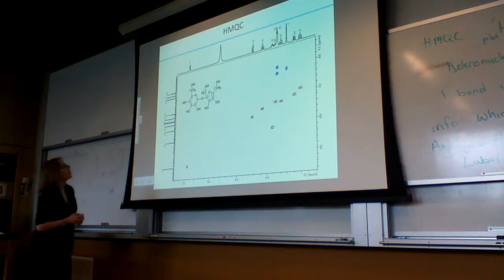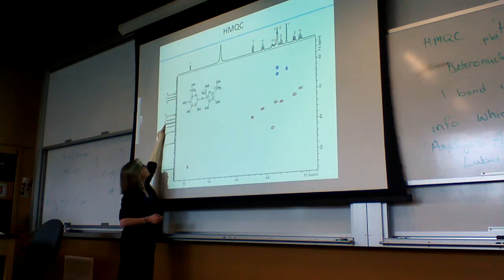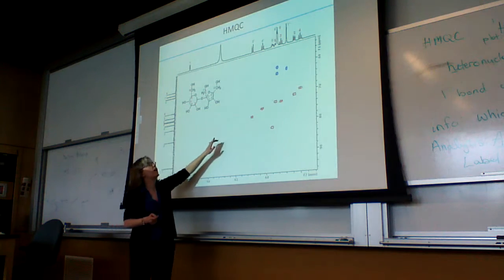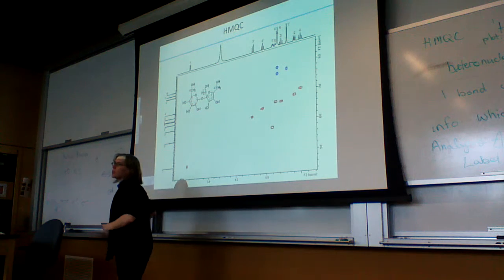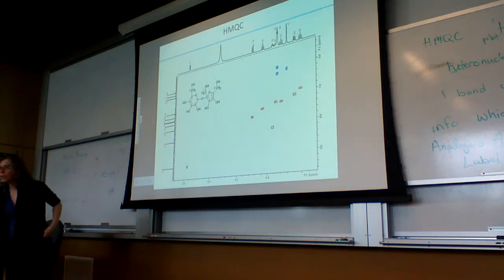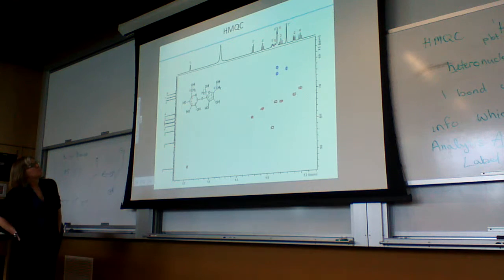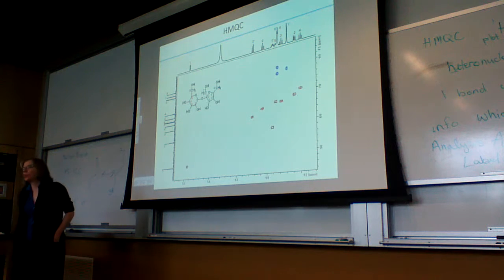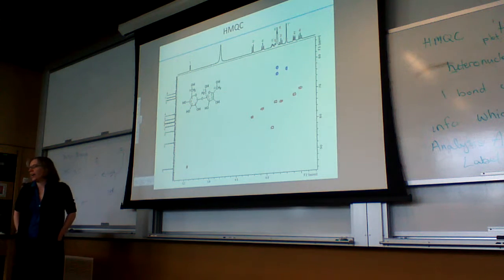One of these cross peaks here shows the separation of the peaks. See, there are 2 peaks here, 3 and 5, but when you separate it out into the 2 dimensions, you actually see the separation of those 2. Some hydrogens may show up as not having a signal in the HMQC. Which ones would those be? An alcohol or an amide, or anything not connected to a carbon. So that can give you that information as well.